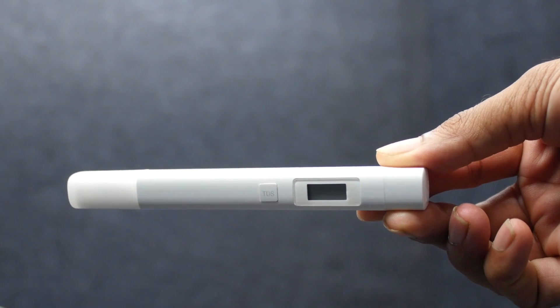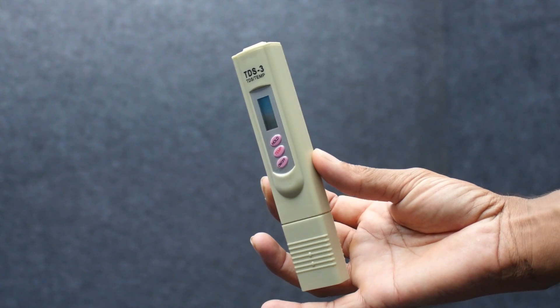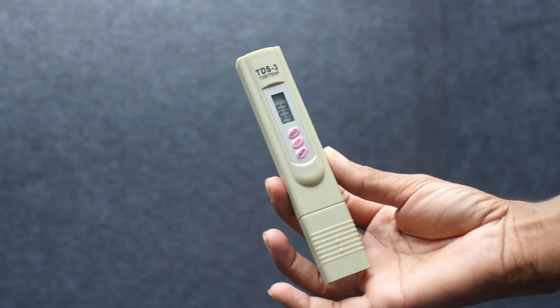There is an LCD screen on the device. There are 3 buttons: an on/off button, a temperature button, and a TDS calculation button.